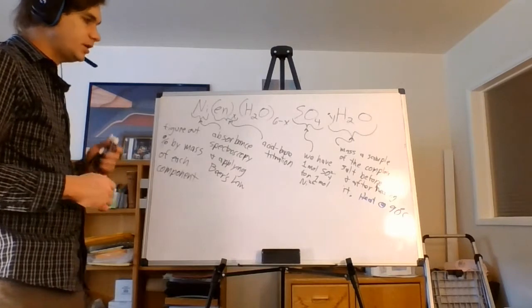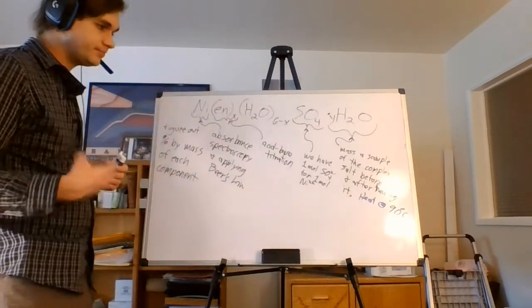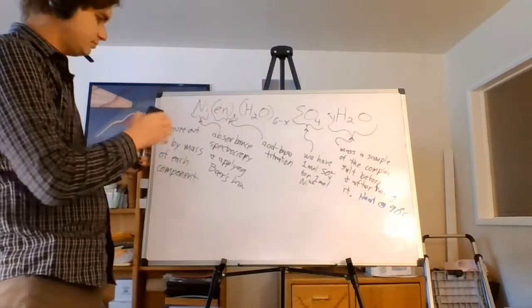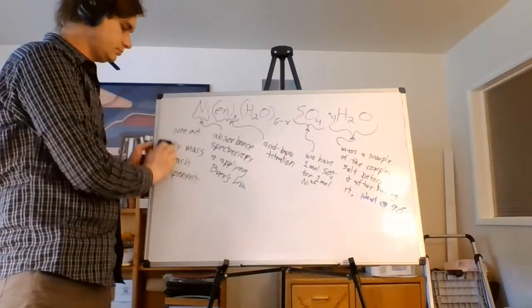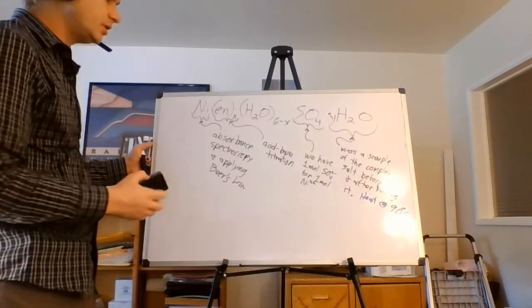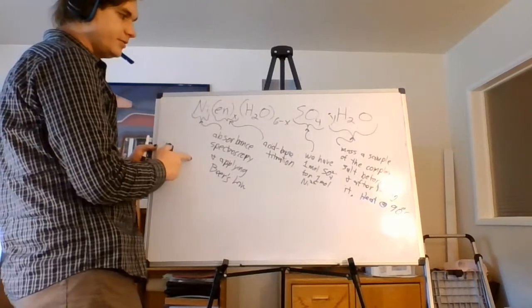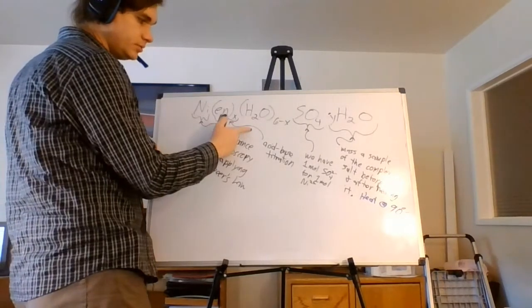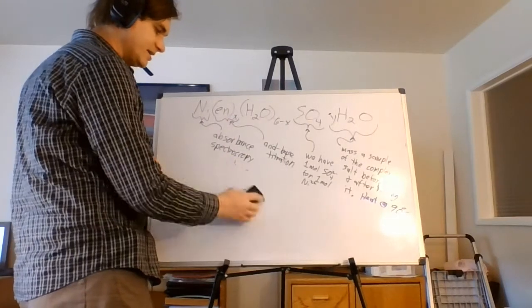So, how do we go about each of these? Well, let us start with the earliest one in the schedule, the acid-base titration.